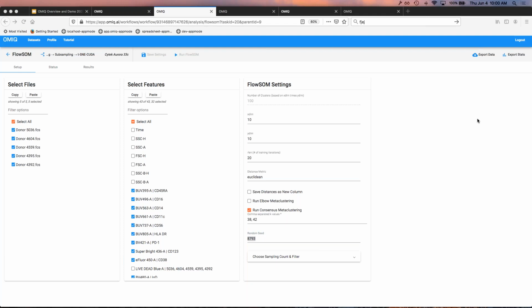Since this is a cloud application, what security protocols are in place to protect the data, and what does a local IT group need to consider to allow access to the system?